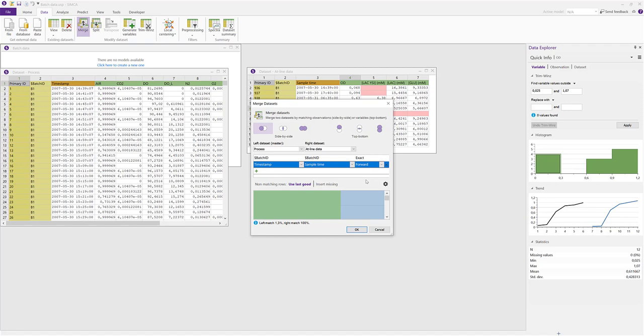The columns in the slave data set used for matching, in this case the sample time column, will be removed from the final data set. But if you want to keep it, you can do so in the options menu.